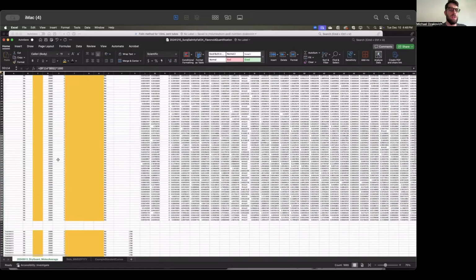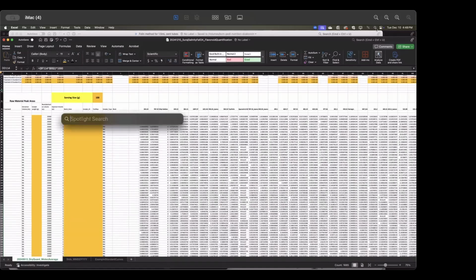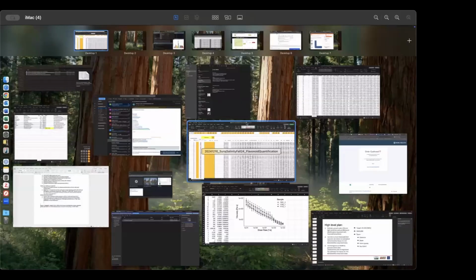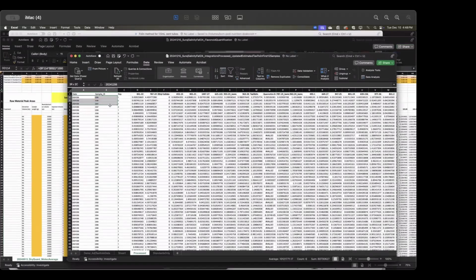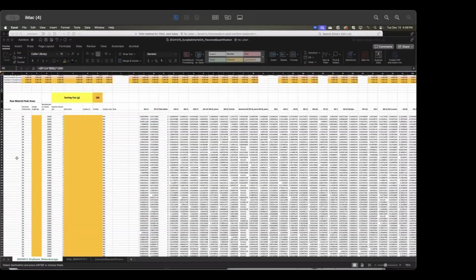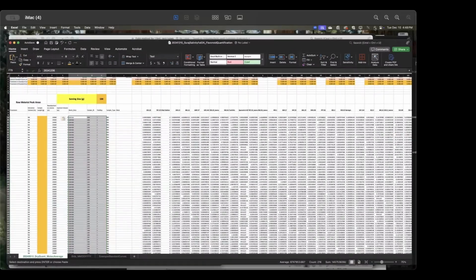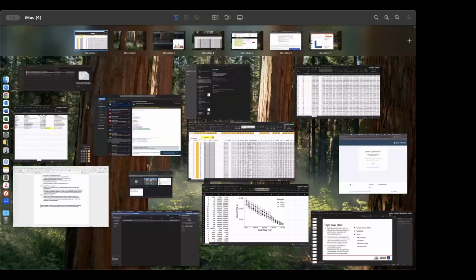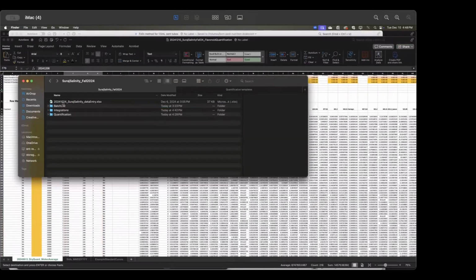So now what we need to do is fill in some of the information that we're missing here. So I'm going to move my inset here. Shift control. Okay, so we've already done this, so that's easy. Boom. Now what we need is to get these sample masses. We can find that in, let's see here, our data entry sheet.